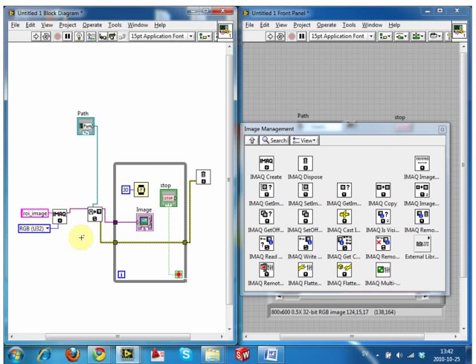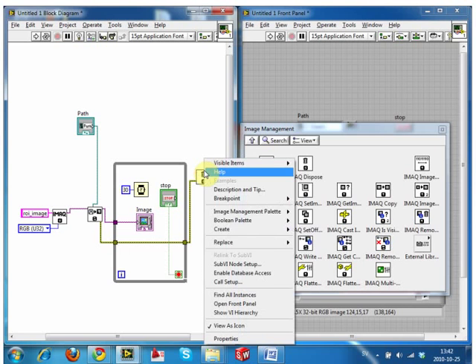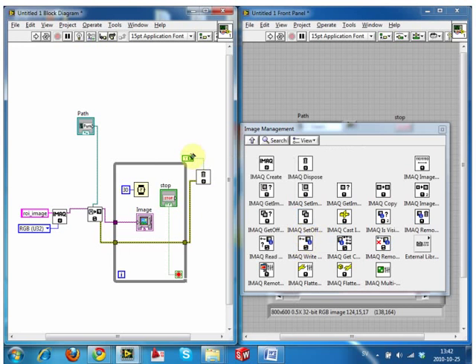So if you know you don't need this image again in this program, what you can do is just say destroy all the images I made, because I just want to clean everything up. So the way to do that is if you right click on the top of this trash can where it says all images and just create a constant, there's a little true false switch. If you hover over here, it's kind of saying, do you want me to trash all images? And the default is always no, just trash the image that you told me to trash. But what we want to change it to is true. So if you click on the T value, which now says, once this error line gets to me, in other words, the end of the program, I will now destroy all of the images I created. And that's a much better way of doing it for programs where you're using more than one.